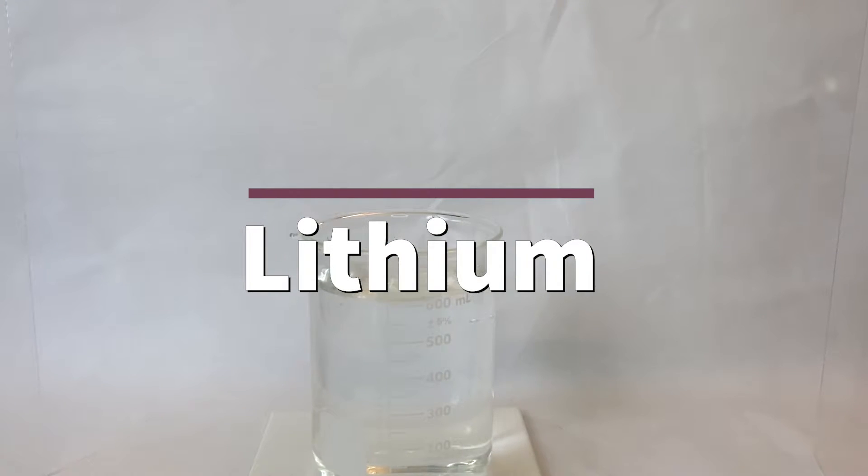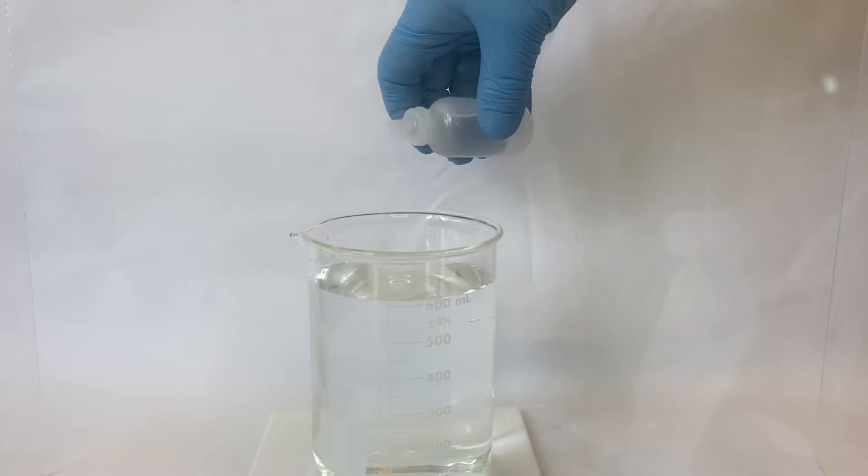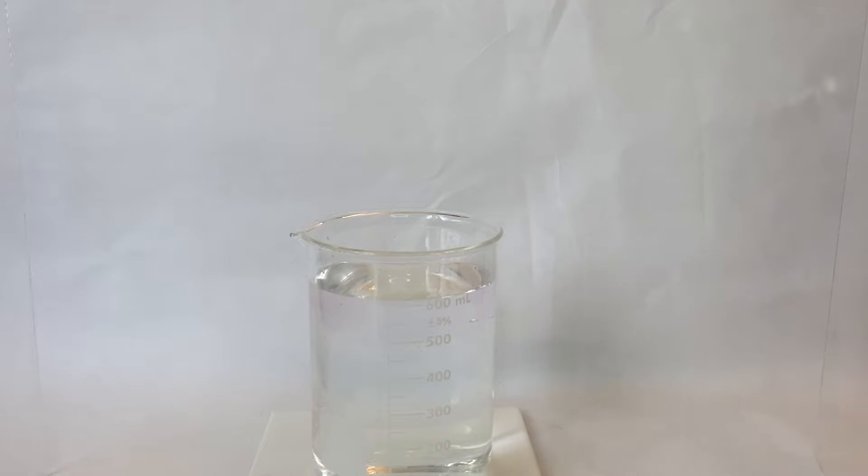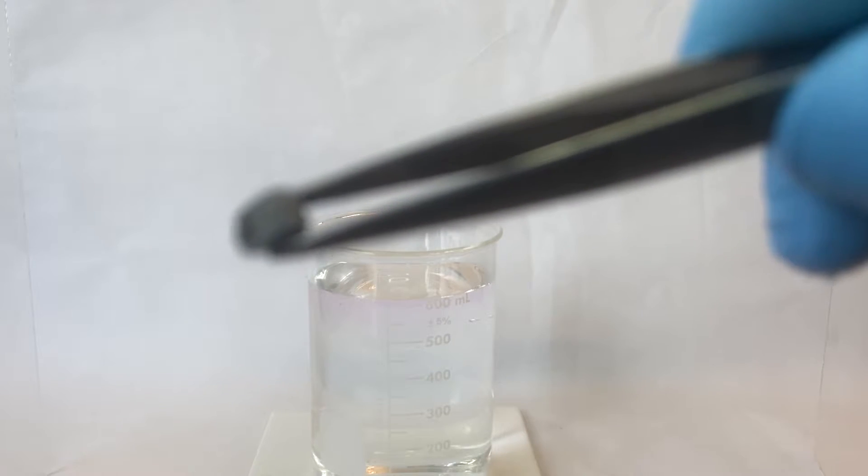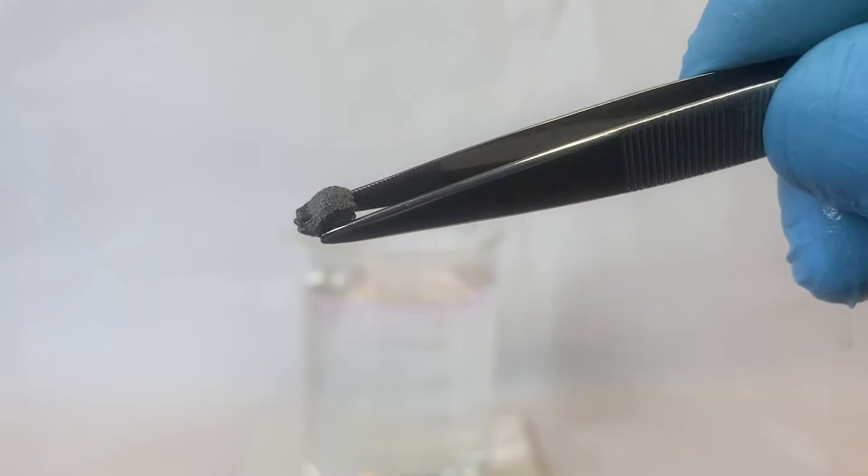We will start with lithium today. I'm going to take a beaker full of distilled water and to that I'm going to add a few drops of the pH indicator phenolphthalein. Notice that the phenolphthalein is initially clear as we assume the pH of this water is approximately neutral. Here is our sample of lithium. The alkali metals are low density metals and they tend to be very soft. They're very easy to cut with the spatula or the forceps. Let's drop our lithium into the beaker and see what happens.